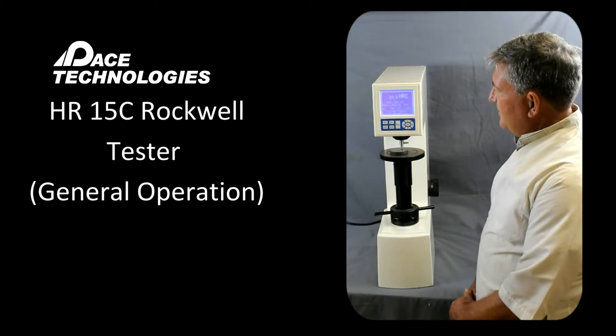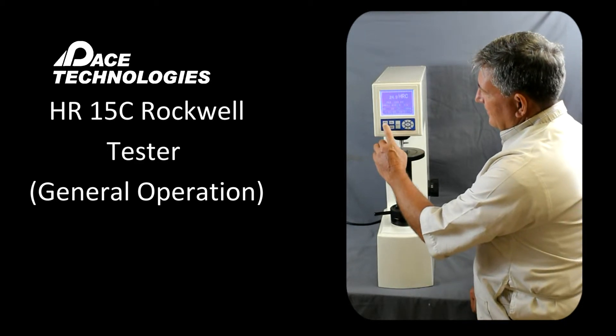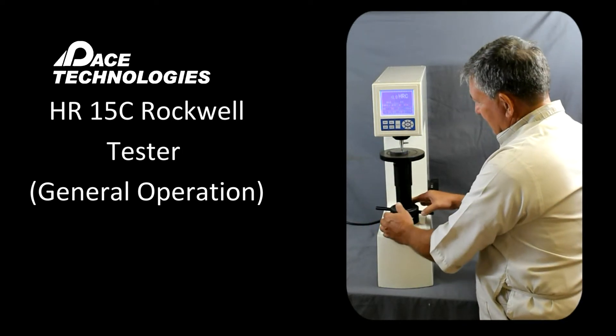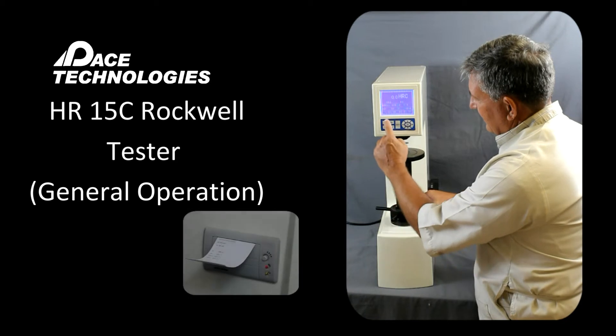If you're ready to print your results, there's a key here called PRT. What you need to do first is back off the stage, take the load off, and then hit print.